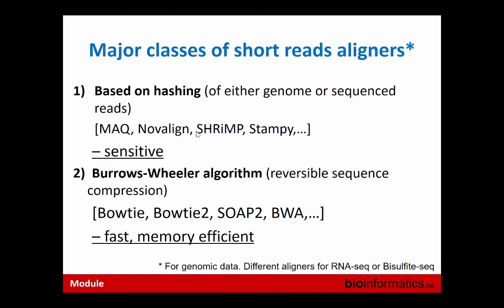That's, of course, a very simple way of showing it, because, as I mentioned, we allow mismatches, and those aligners take care of a bigger table, not only a table based on the genome itself, but allowing some mismatches in every genomic location. The second type of aligners are faster, more efficient, because they use compression, and that's the trick. Your search space is smaller, and that's why they're faster. While the first type of aligners are more sensitive. So that's a trade-off, speed versus sensitivity, because we don't want a very, very precise aligner which will find the absolutely optimum solution to place our FASTQ file onto the genome, but will take months and months. So it's always a trade-off.